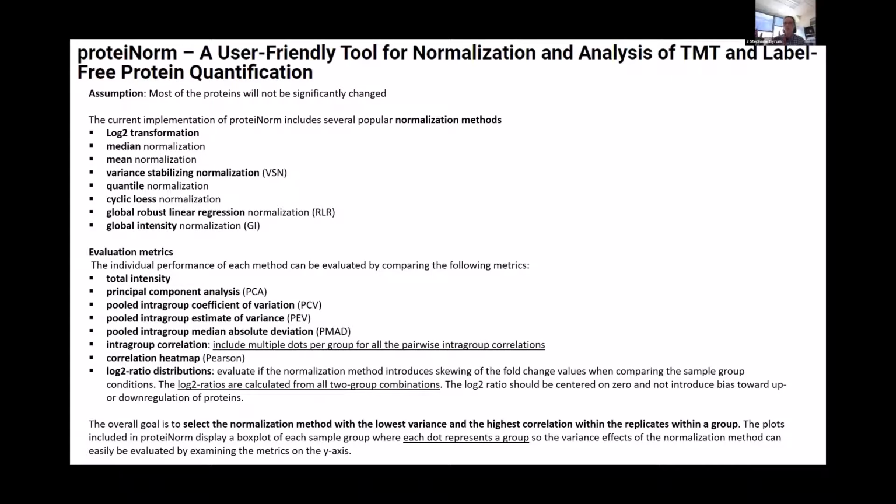All of your high abundant proteins tend to be significant. They've all popped out. The ones that are changing are the lower abundant ones, where you may have some missing data included in some of the peptides, or a bad peptide identified at one of those lower ones. So I think it really depends on your dynamic range of your proteins and your distribution, how much variance you have. It's all going to be different depending on the data set.